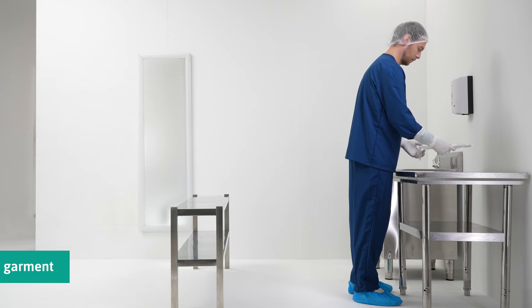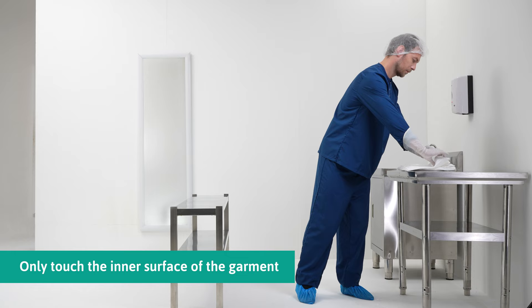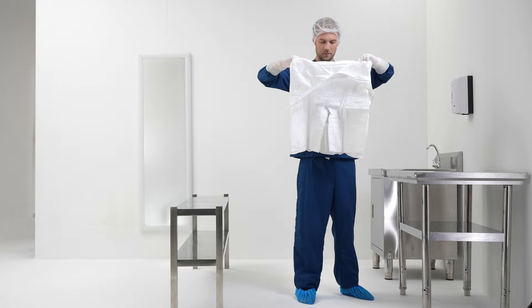Only touch the inner surface of the garment. Grab the coverall at the waist area.